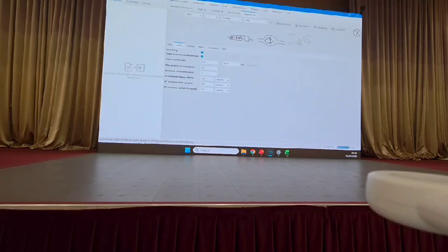scans to make a feature. If you have really wide peaks, you might want to have more scans. And this is something that you just have to get familiar with your data. And in our case, we'll put 6. So we know for our data, 6 is good. Again, out of the box, 4 will probably be fine. But it really is up to you, the expert of your own instrument, of your own data, to just try and play around with the settings.